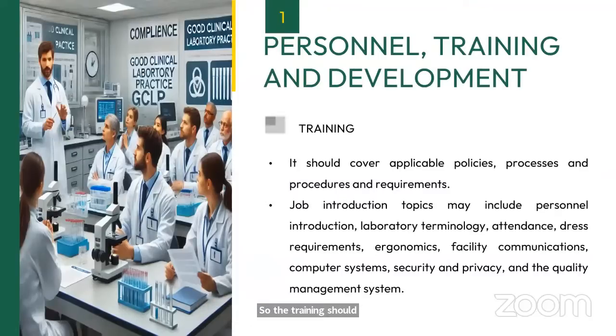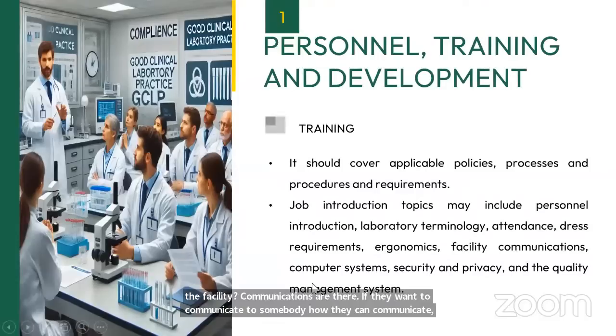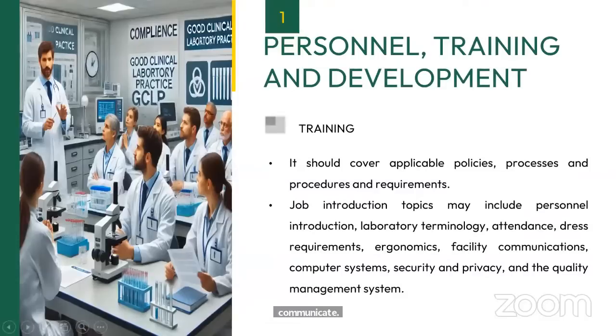Like yesterday, we started the training program with some of the definitions. They should have an appropriate introduction to their colleagues, to the other persons who are working in the laboratory, how to maintain the attendance, what the dress codes are, what the facility communications are, and if they want to communicate to somebody, how they can communicate. If there is any software, LIS, or computer systems used, how to operate those systems and how to maintain security and privacy. All these components should be included as part of the training program.